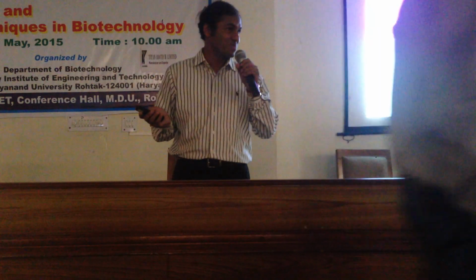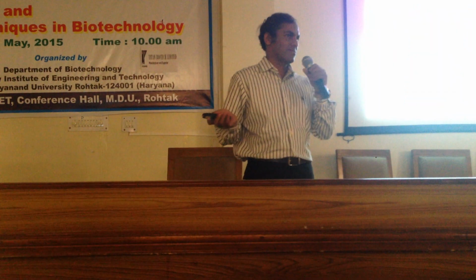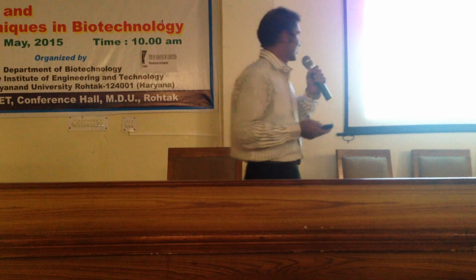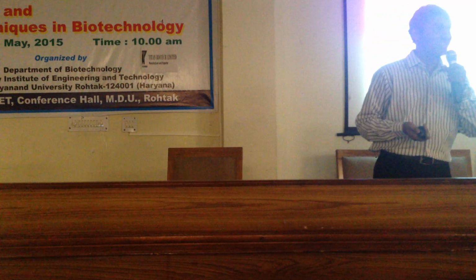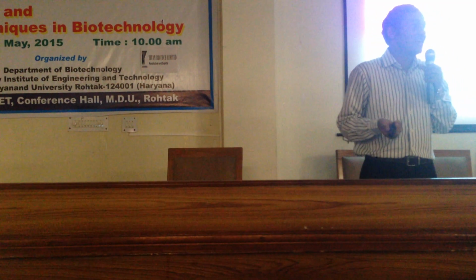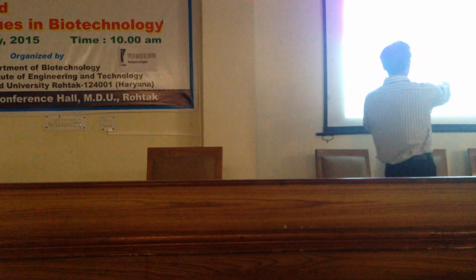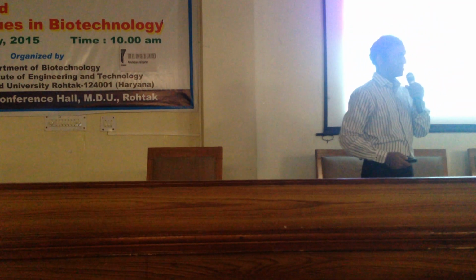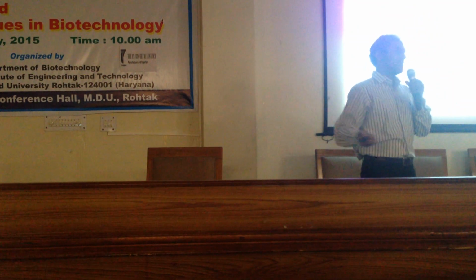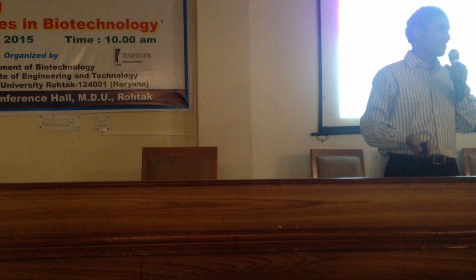So I said here the next generation sequencing technology is moving, so the previous technologies are all these three. The popular technologies that you might have studied are named Maxam-Gilbert, and I would regard them as Sanger, Fred Sanger, because Maxam-Gilbert technology is something which nobody wants to talk more about.